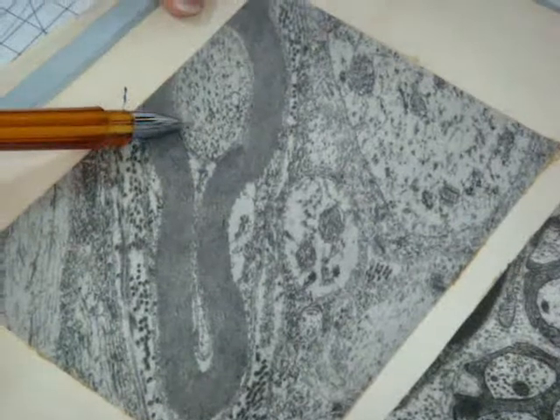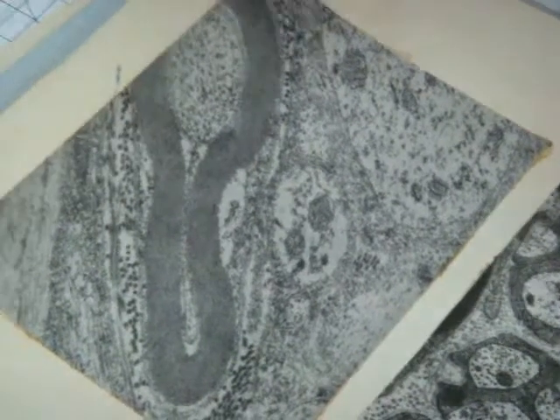This is again a myelinated nerve fiber. Inside will be the axon. This is myelinated, with myelin sheaths. This is unmyelinated. This is myelinated, but this is an oblique section, and these are collagen fibers.